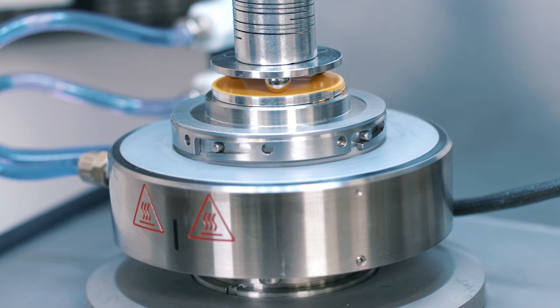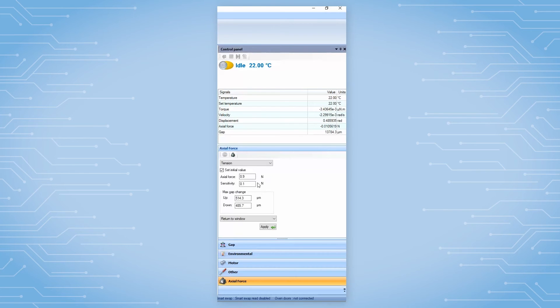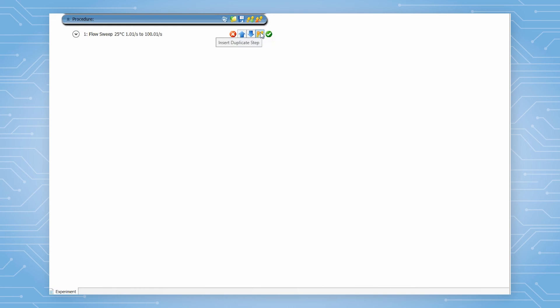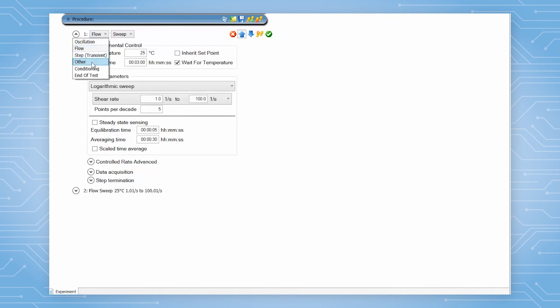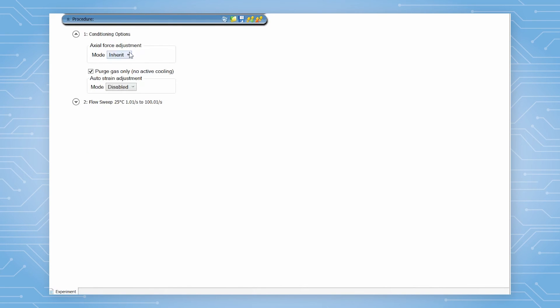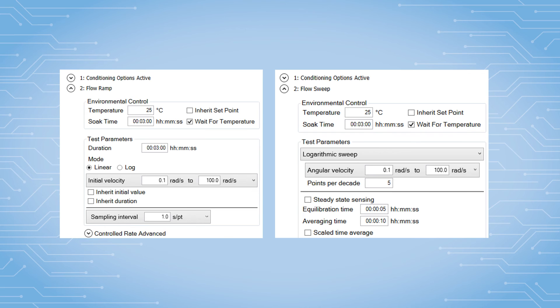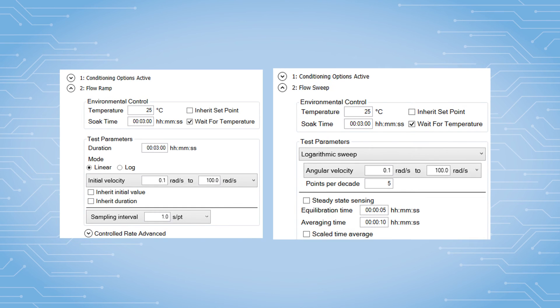After that, lower the upper geometry until it is in contact with the bottom plate. Apply a constant axial force, either from the TRIOS control panel or in the test procedure under the conditioning step. The test procedure for measuring the coefficient of friction as a function of sliding speed can be either a flow ramp or a flow sweep.